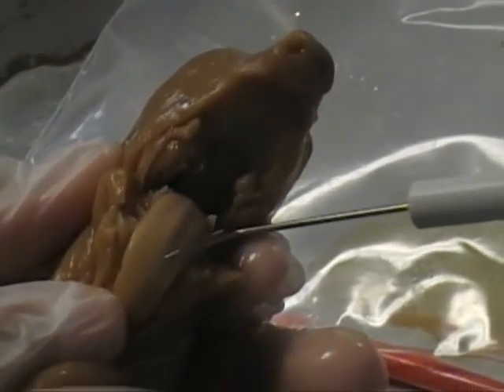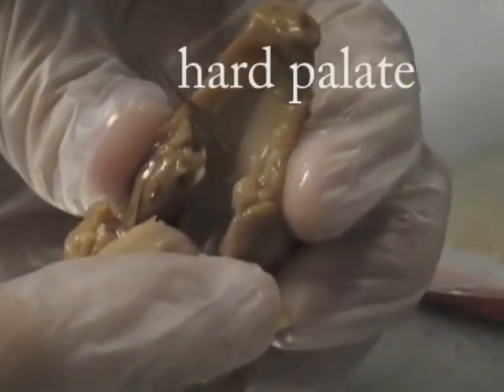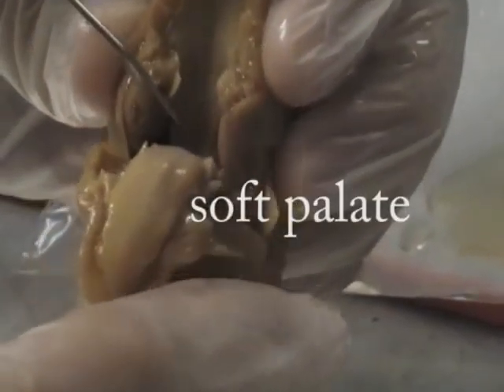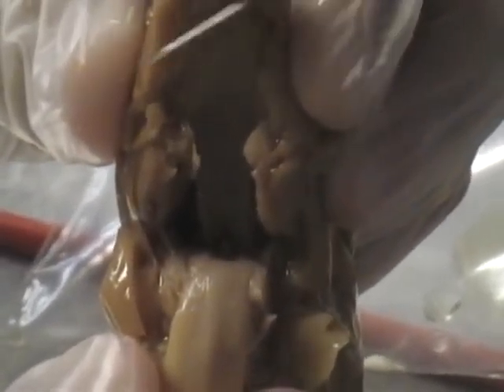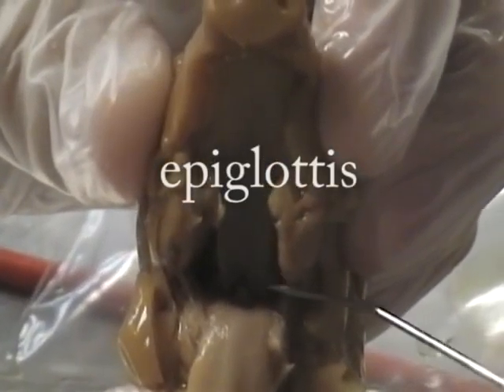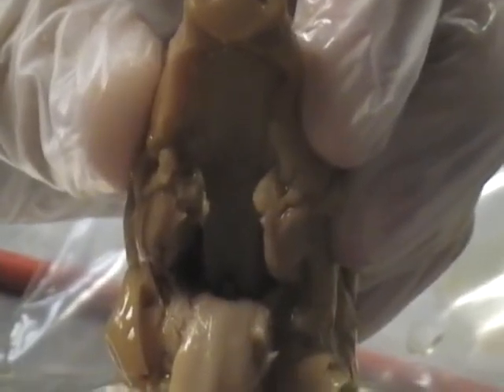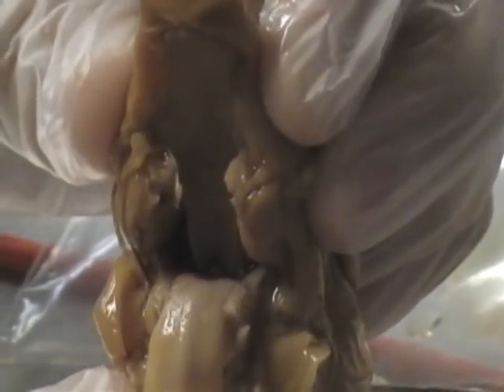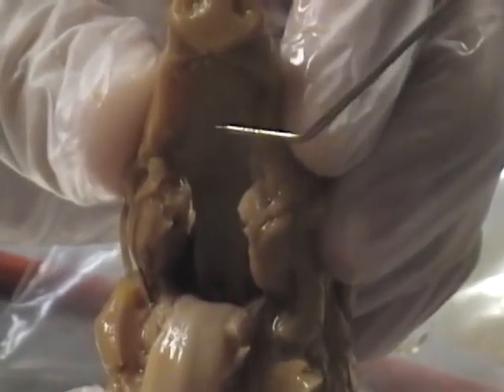Okay. This is the tongue. This is the hard palate right here. This is the soft palate. Can you see the soft palate? Right here. The epiglottis is down in here, right here. You see? And we don't have teeth because it's so young yet.